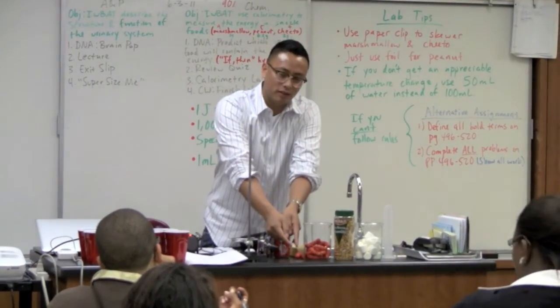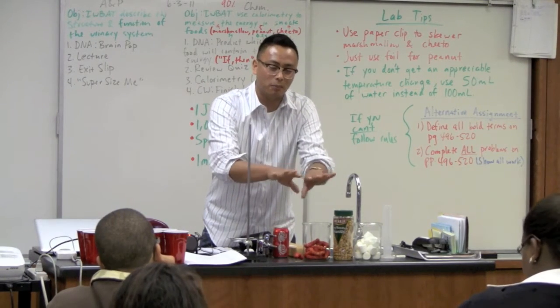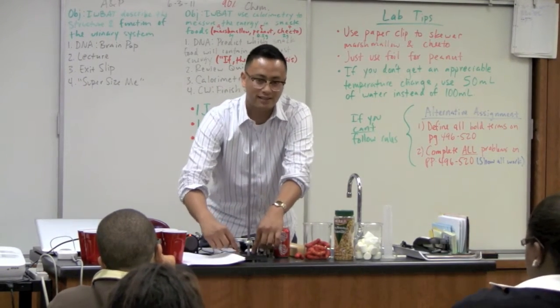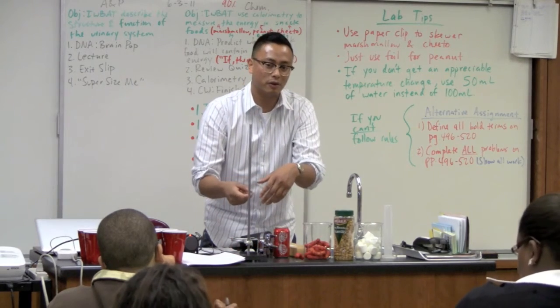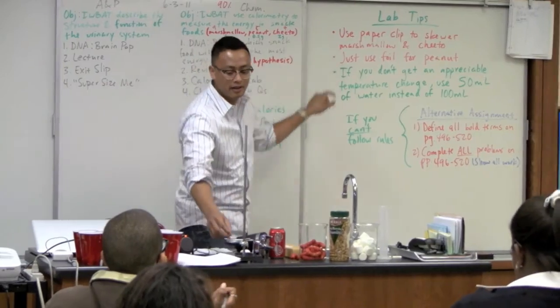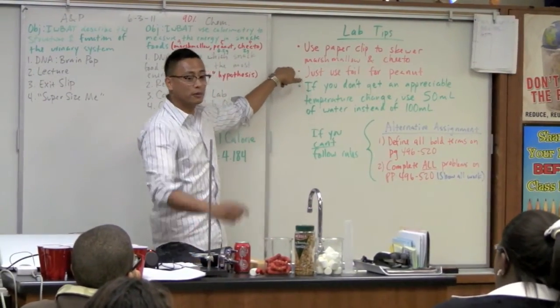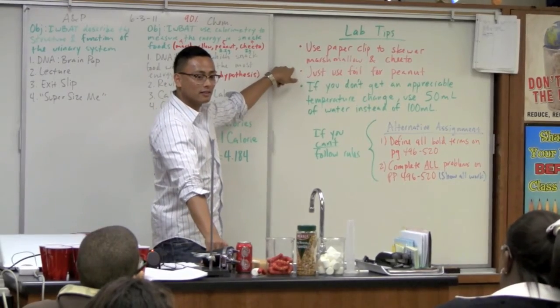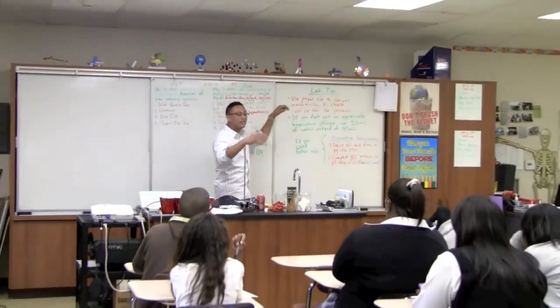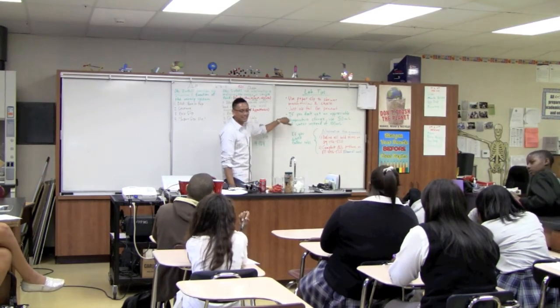However, you can't really do this to the peanut, so that's one of the limitations of this lab. The peanut, you're just going to place foil on the base of your ring stand, and you're going to burn it directly on the foil. Is that clear? Yes. So that's the first tip. Use the skewer for the marshmallow and the hot Cheeto. Use the foil for the peanut. Question? I was saying elevated with the foil. That's true too. But then that doesn't allow the oxygen inside. Oh. You see?